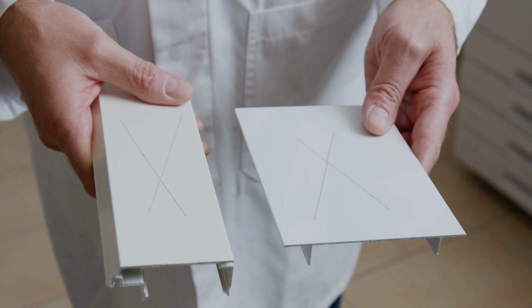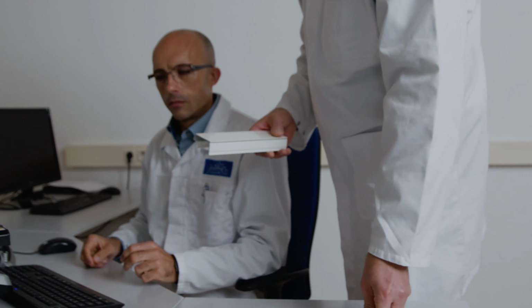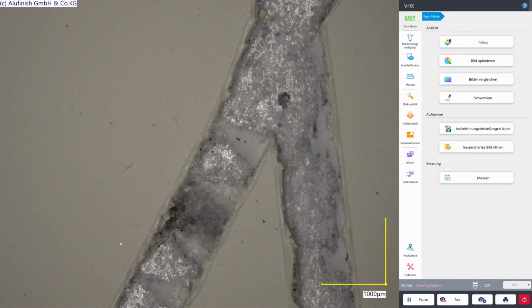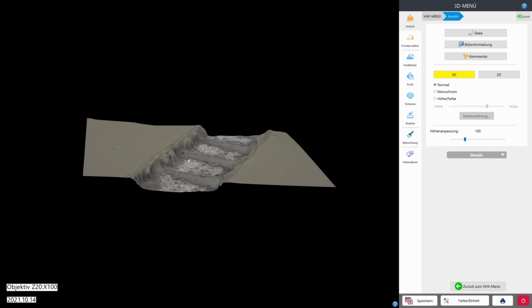In the last example, it is just a matter of a simple inspection possibility, where an artificially applied scratch on this painted surface is to be checked. Does it really reach into the base material as prescribed or not? This could otherwise lead to different results in the subsequent corrosion protection examination.